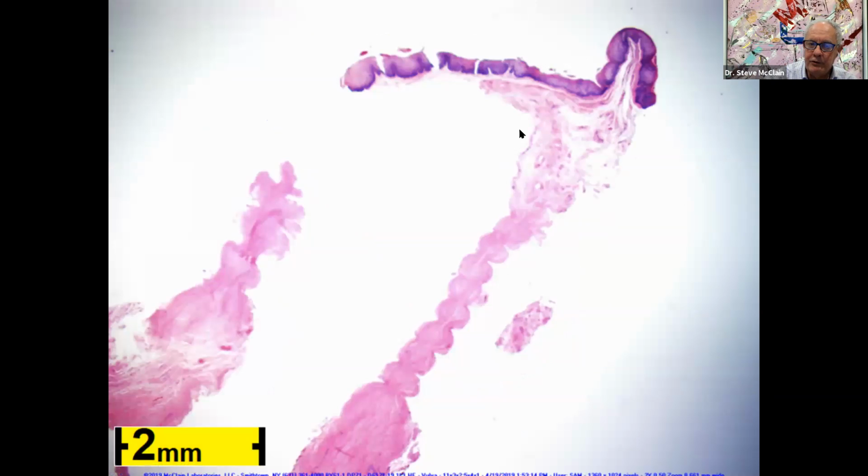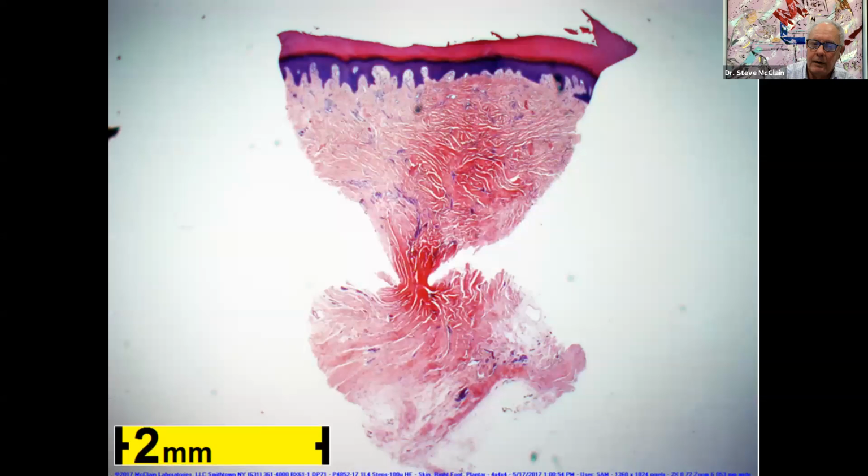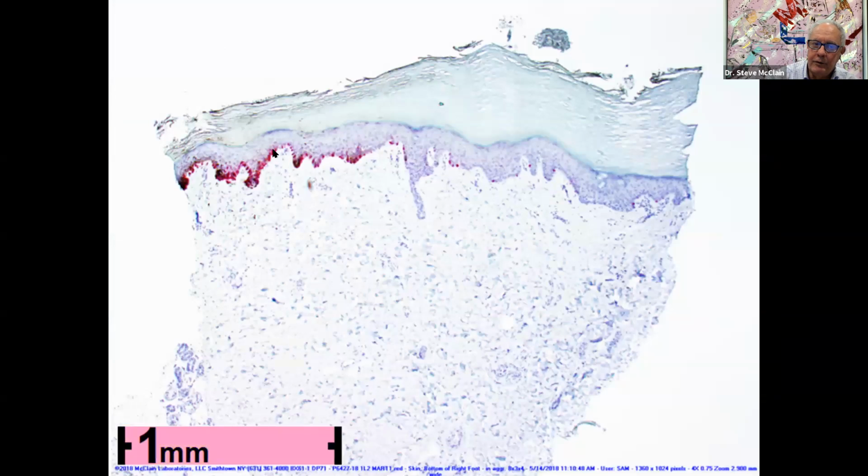This is what happens when you squeeze it. You ruin the tissue. Almost worthless to the pathologist. All this is crush artifact, and we can't tell much about it. Crush artifact is almost never done by dermatologists, done by podiatrists, by and large. If you're doing immuno studies, the immuno in this half was damaged by the crush artifact, and so this is the same lesion all the way across here, except we can only see a few melanocytes.